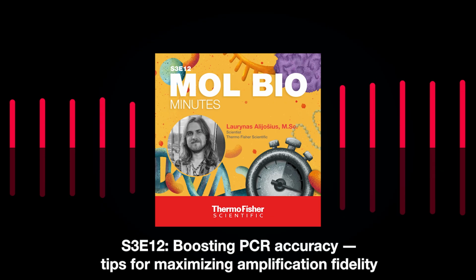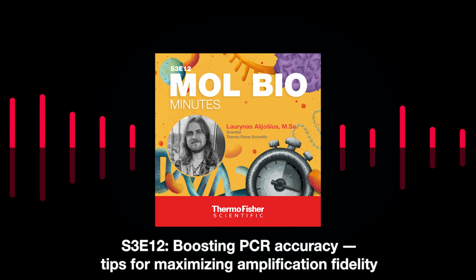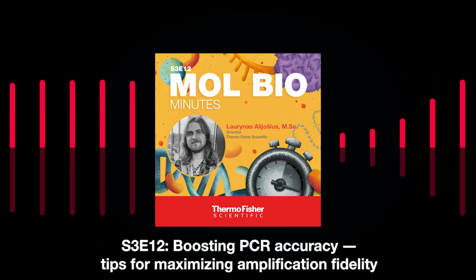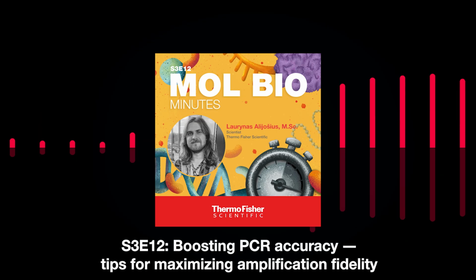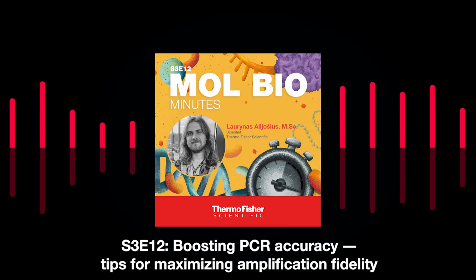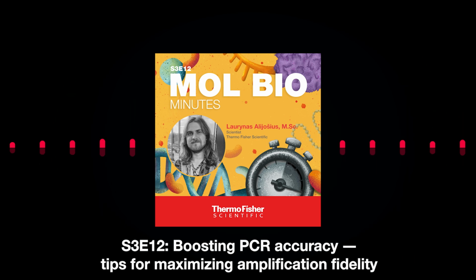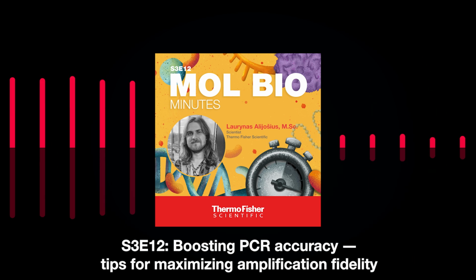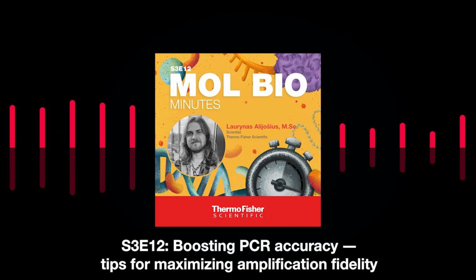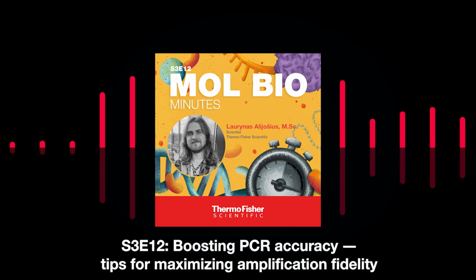Magnesium ions are essential for your PCR reaction to happen. But if you have too high a concentration of magnesium ions, that can negatively affect the accuracy. And there are some other ions that are called similarly, but not the same. These are manganese ions. Oh, you want to avoid these manganese ions because they can increase and mess up your polymerase error rate in a bad way. So you want to avoid that.